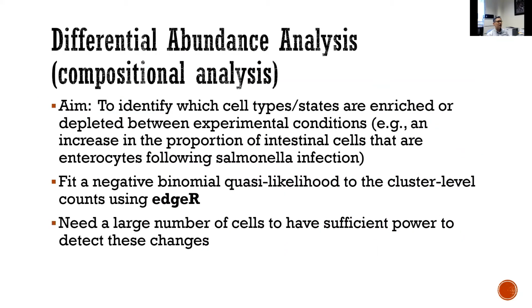As we mentioned, if you have two samples, say you have sample 1 and several clusters, and you have sample 2, which also has some clusters. If you know this is cluster 1, 2, 3, and similarly this 1, 2, 3, and if you compare and you realize, okay, cluster 2 was, say, 20% of cells in sample 1, and it becomes 60% in sample 2. So this is called composition change.